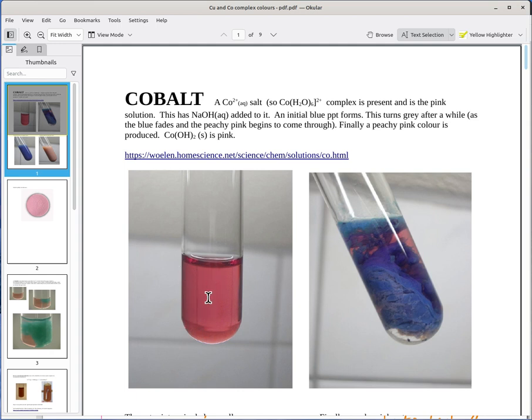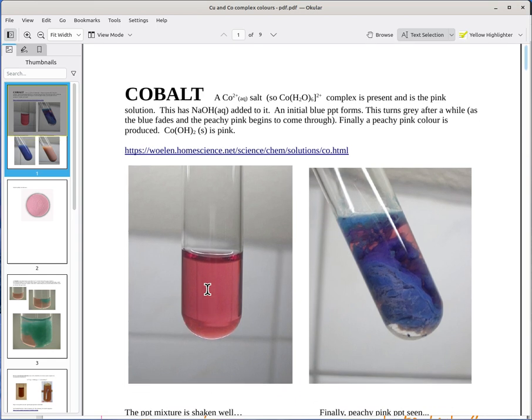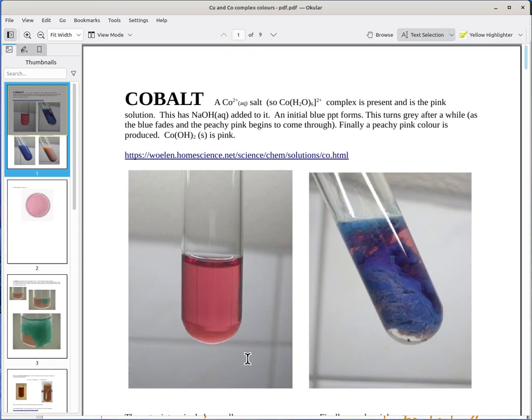Okay, you can make this super intense. It almost begins to look a bit red. You can make it look super pale, and it looks like an extremely pale pink color, like Mn2+ aqueous solutions. So this is a kind of middle of the road thing. It's reasonably concentrated. It's not too dilute. So you get a good appreciation of a typical color that you might expect.